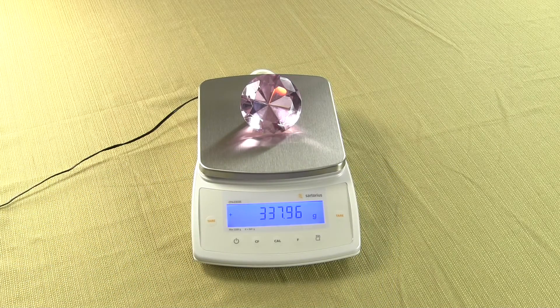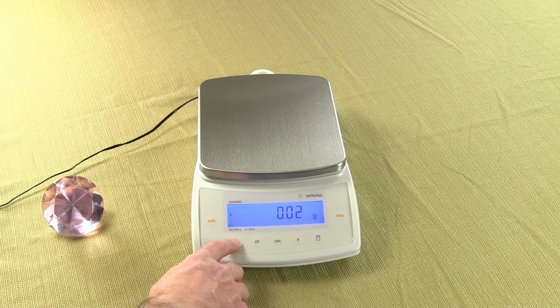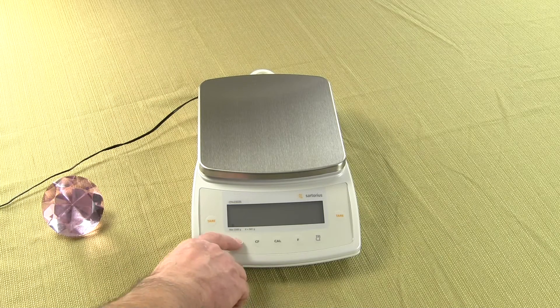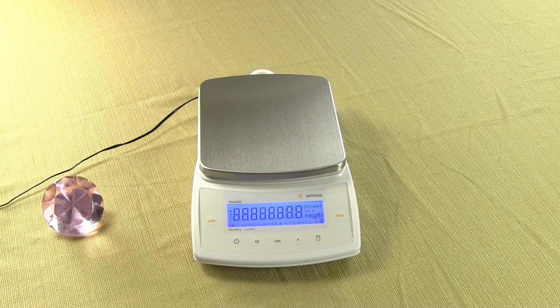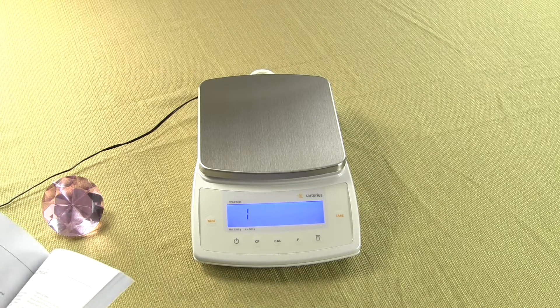So let's show you how to change the weigh unit. What you want to do is first take the item off the balance, turn off the balance, then turn on the balance and press the tare key and release. You will see the balance should go to the number 1. According to the manual, to weigh in carats, the code is 313.